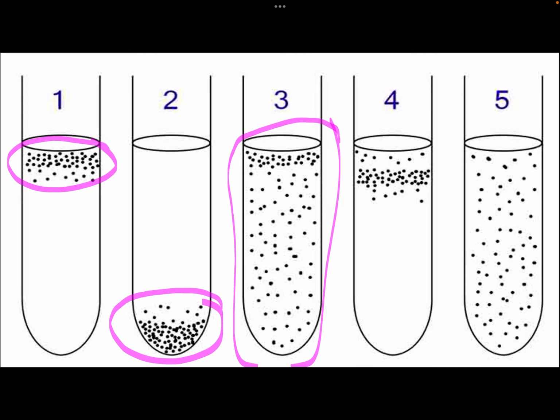You can find growth all throughout the broth, whether at the surface, at the bottom, or at the middle. Usually, these are facultative bacteria. They can live with or without oxygen. How about this one? Subsurface growth. As I mentioned, usually they gather at the upper part of the test tube, but not really at the uppermost, not at the surface. So these are microaerophilic. These microbes require only a smaller amount of oxygen.